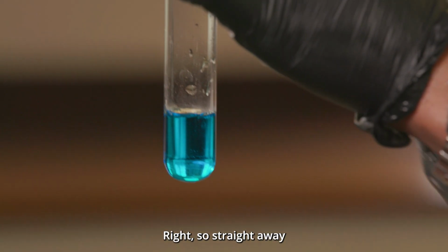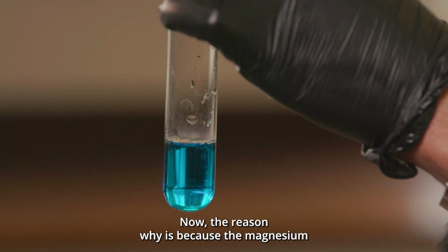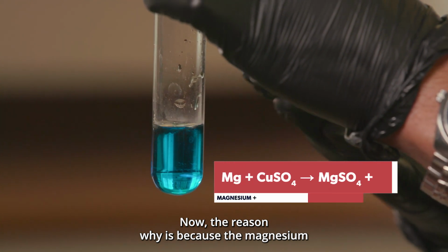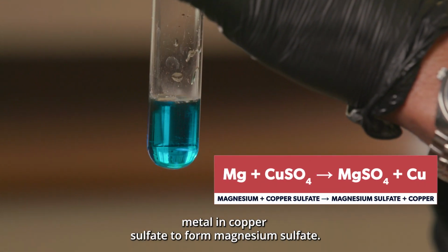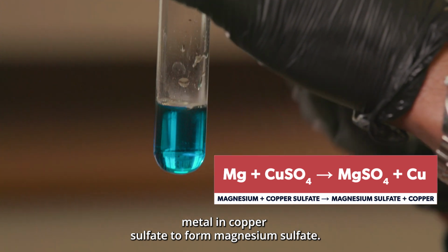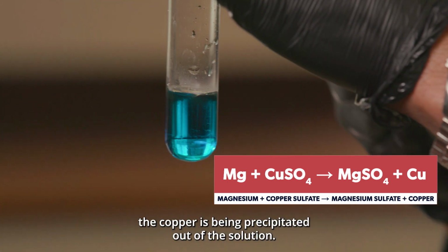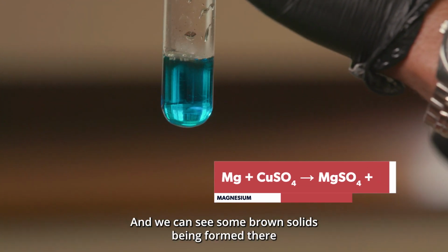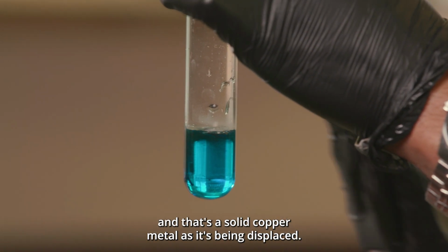Right, so straight away we can see a lot of bubbling and fizzing taking place and some effervescence. Now the reason why is because the magnesium is more reactive than the copper, so it's able to displace the copper metal in copper sulfate to form magnesium sulfate. Now as the magnesium sulfate is being formed, the copper is being precipitated out of the solution, and we can see some brown solids being formed there, and that's the solid copper metal as it's being displaced.